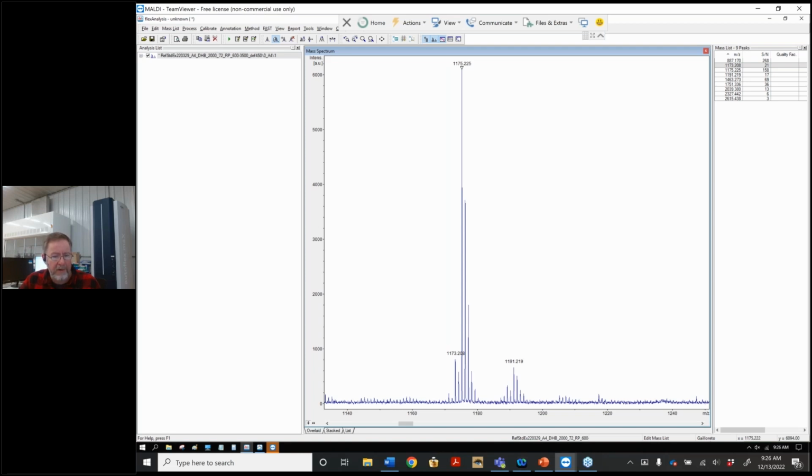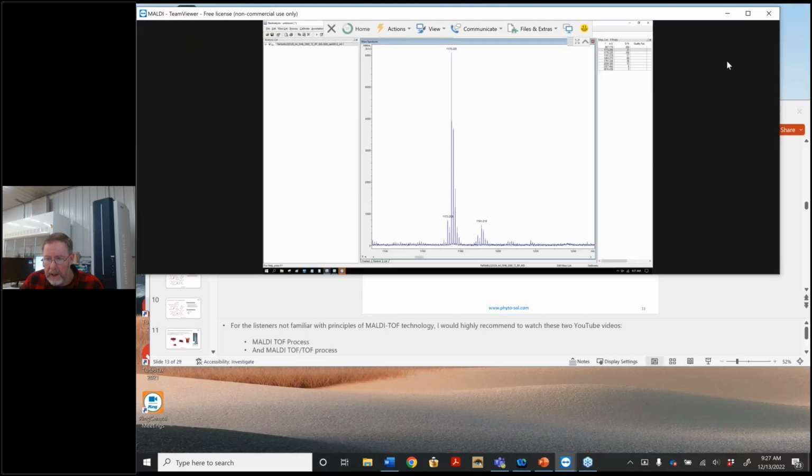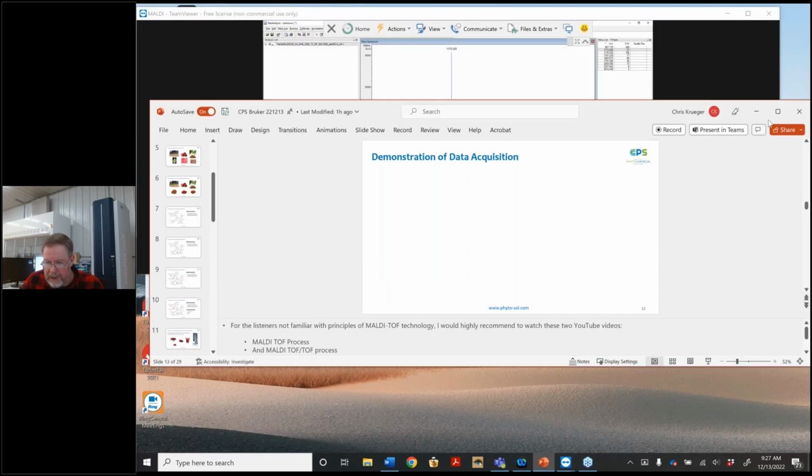And so with this information, we can go into a further inspection into what we're going to call a deconvolution and multi-component analysis to see how these unique fingerprints can help us characterize and categorize the botanicals that we're working with. So I'm going to exit this window again and get back into the presentation.